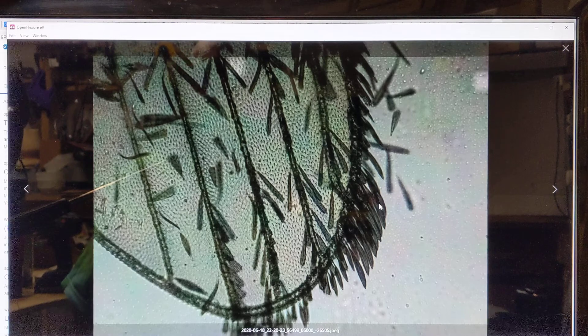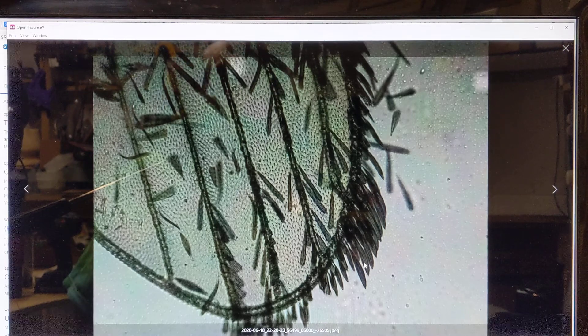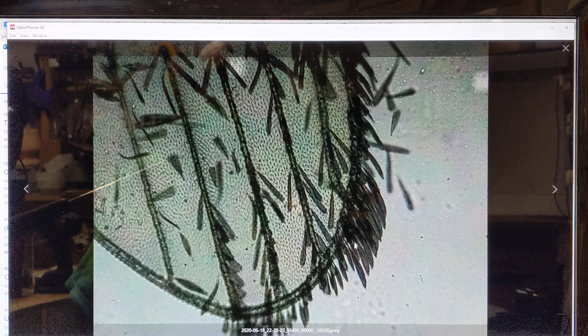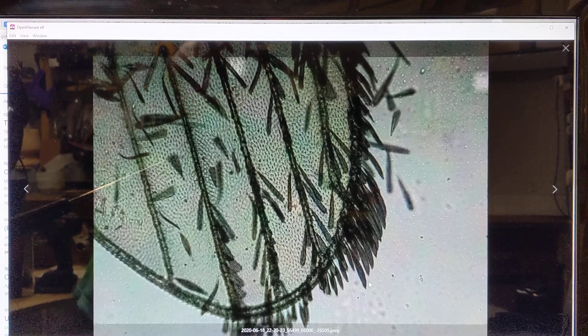They're probably not actually feathers, but they sure do look like feathers, even with the little vein going down the center.